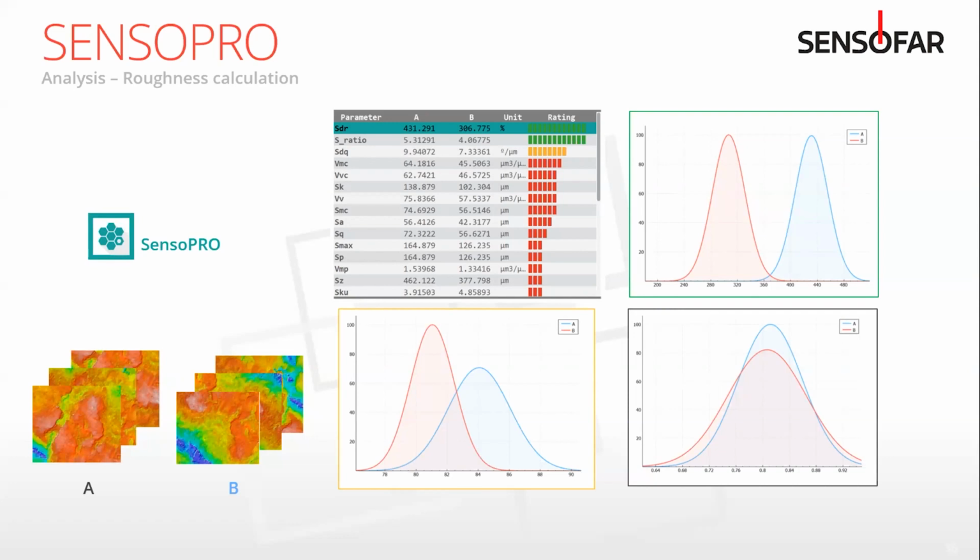We have a lot of customers that notice that something is different between their samples, but they're in the process of, as David mentioned, taking this and automating it so that it's not quite as subjective to the person that's looking at it that day. And instead we can say we now have found a metric that really accurately describes what's different between these two.